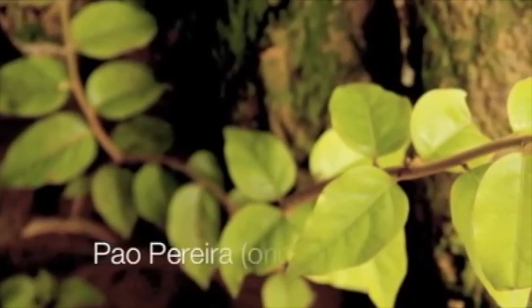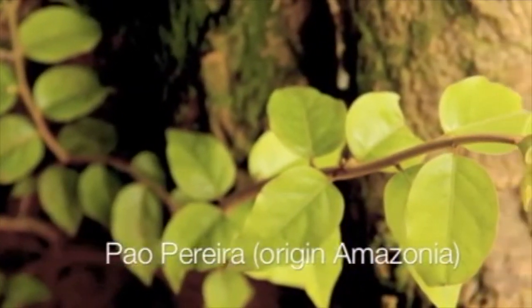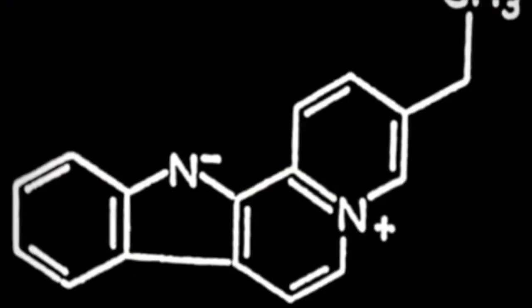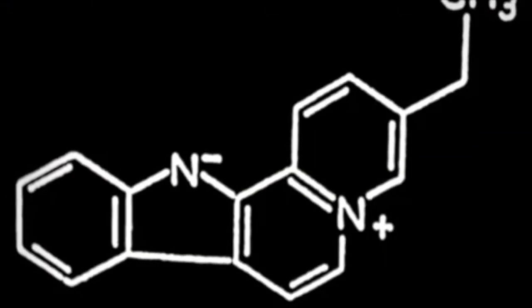The plant-derived alkaloid PB100 is a selective anti-cancer agent. It is active on cancer cells, but has no effect on normal cells. By normal, we mean here non-malignant. The following experiment demonstrates that PB100 rapidly enters tumor cells and accumulates in their nucleus, especially in the nucleoli, but it does not even enter normal cells.